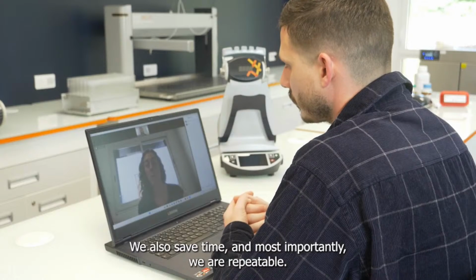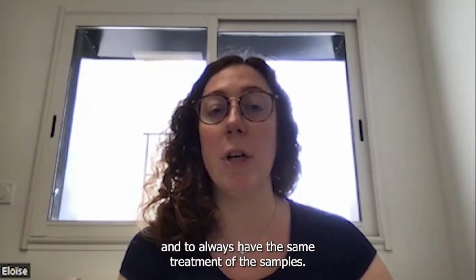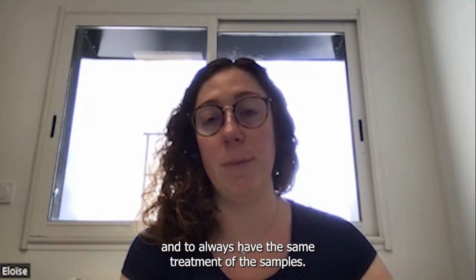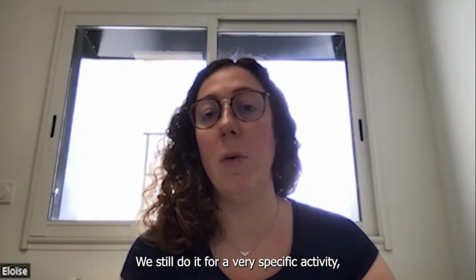We also save time, and we are consistent. This allows us to be uniform across our samples and to always have the same treatment for the samples. Did you do it manually as well, maybe? It still happens to us for a very specific activity.